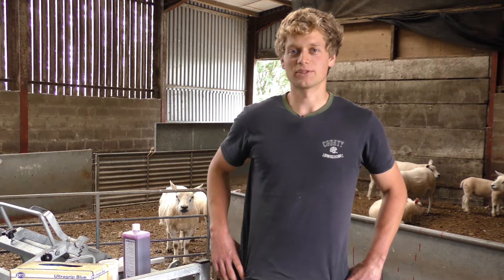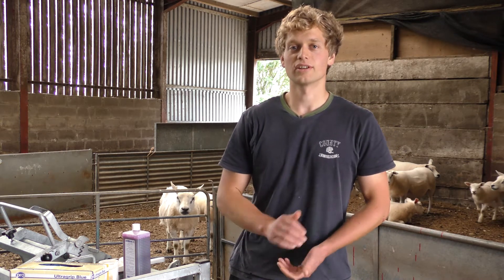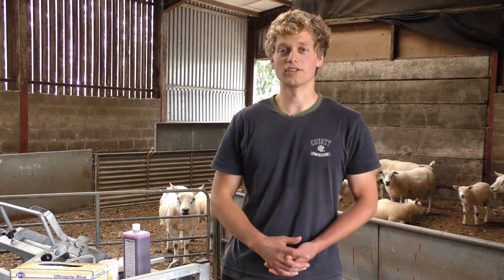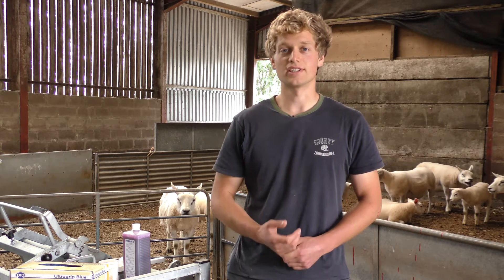Hi, I'm Will. I work for the Texel Sheep Society, and I'm here to show you how to do a California milk test on sheep. A California milk test, or a CMT, is an on-the-spot test used to quantify the level of mastitis present in sheep milk.